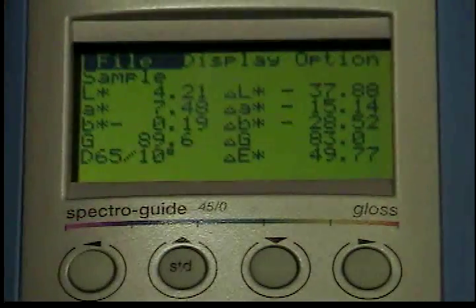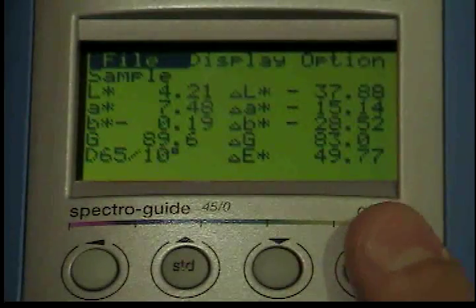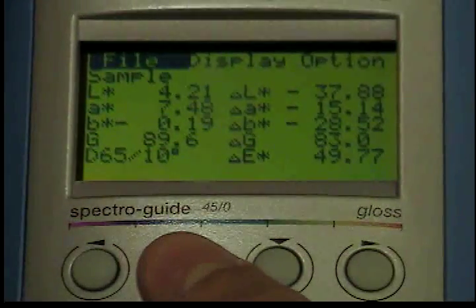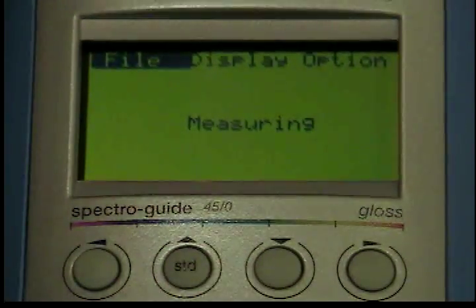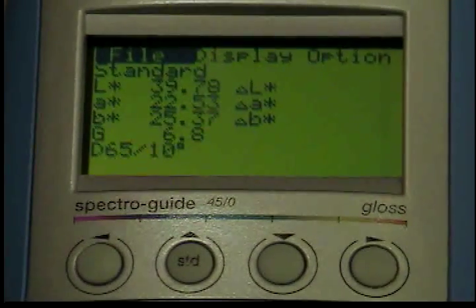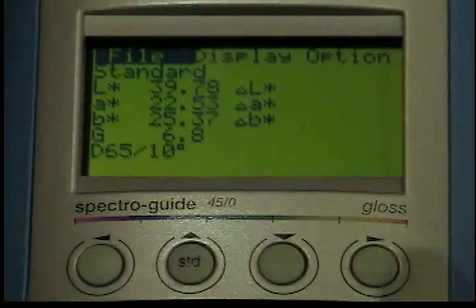Use the button in the difference mode to perform a quick standard measurement. The following message appears on the display: Measuring Standard, Saving.